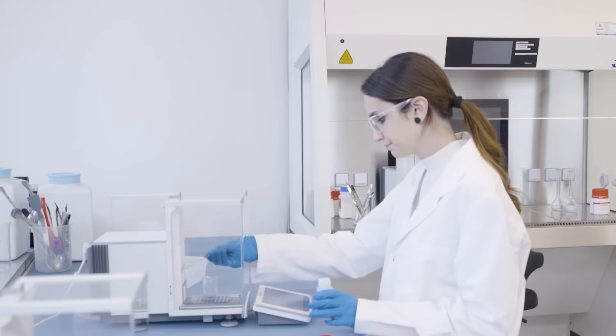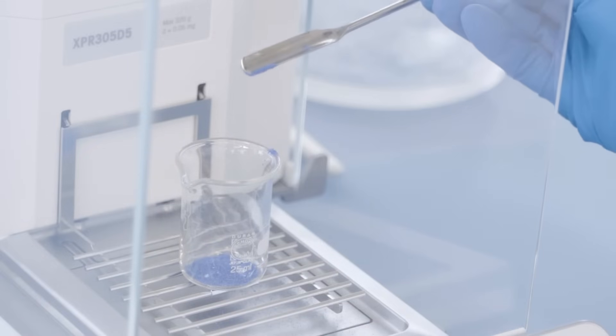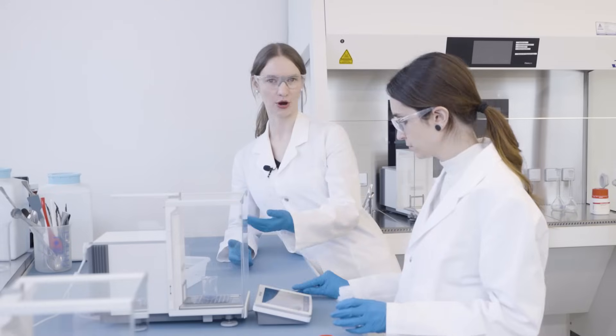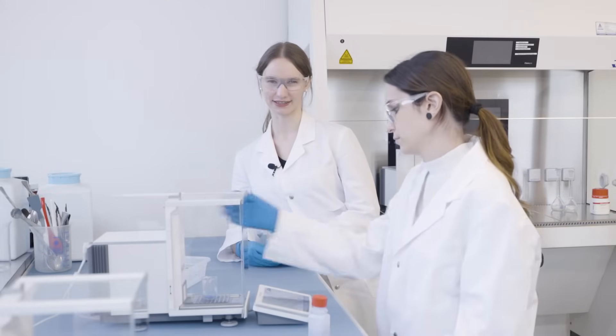And if some samples should be spilled, it won't slow you down. The extra sample will simply fall through the smart grid and you can still complete your weighing task before cleanup.